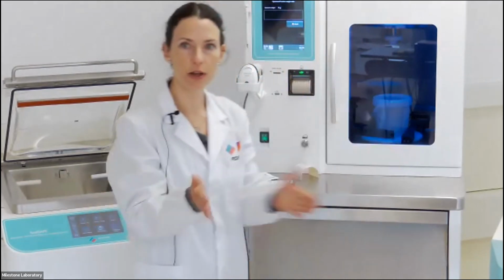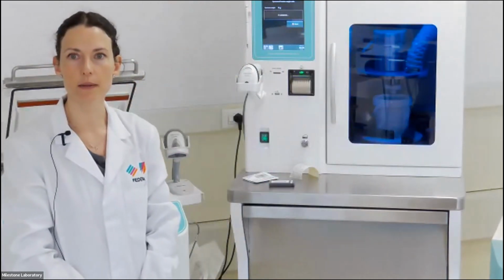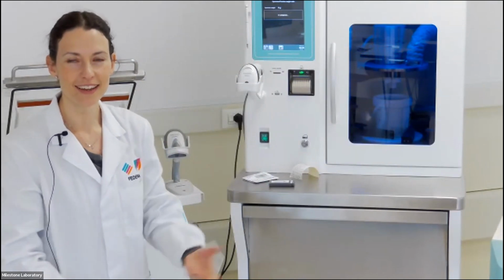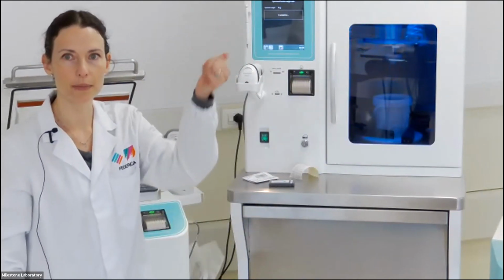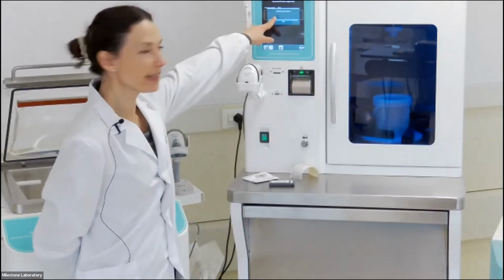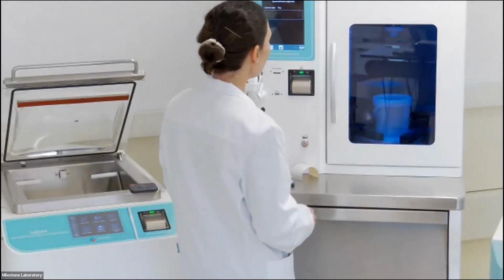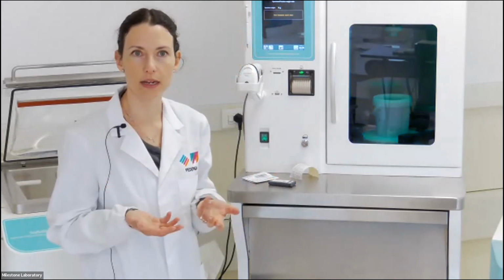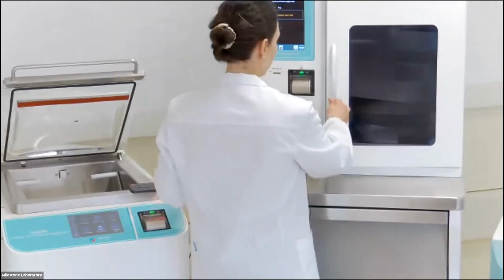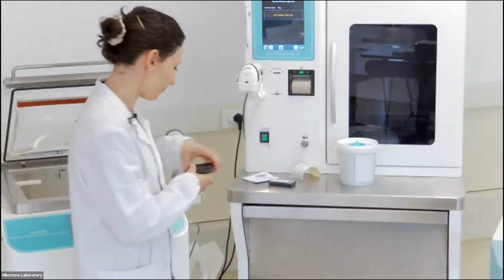You see the spindles position the bucket in the correct central position. Now, you see the formalin injector come up because it detects that the valve is closed. And now here, bucket valve closed, I have the message. So as you can see, it's really not possible to release the formalin if we are not in the correct situation.